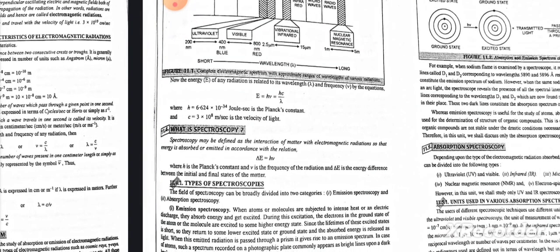Spectroscopy may be defined as the interaction of matter with electromagnetic radiations so that energy is absorbed or emitted in accordance with the relation, that is delta E equals h nu, where h is the Planck's constant, nu is the frequency of the radiation, and delta E is the energy difference between the initial and the final state of the matter. Types of spectroscopies.